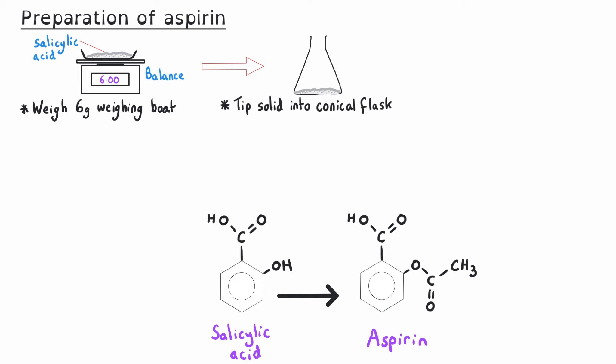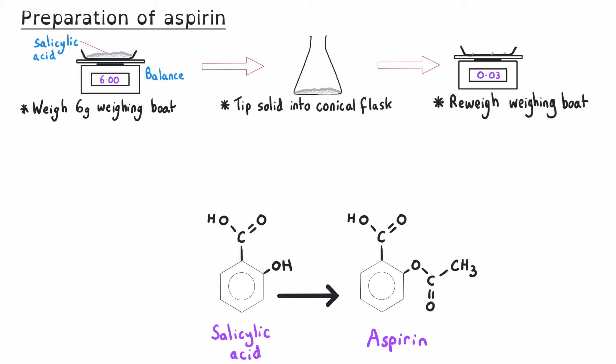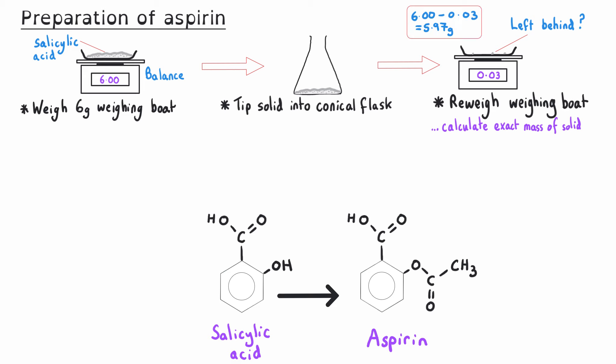Before we start the reaction, we need to make sure we know exactly how much solid has been transferred into the conical flask. So we re-weigh the weighing boat to see if we've left any salicylic acid behind. For example, if 0.03 grams were left behind, this second measurement allows us to weigh by difference and find that we've actually only added 5.97 grams of salicylic acid. This gives us a more exact mass of solid transferred into the conical flask.